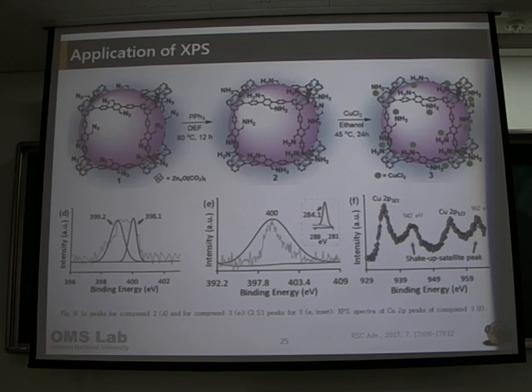Yeah. We give other evidence, for example, TGA. TGA is not very good, but we give this as one kind. TGA, how do you? We try to demonstrate or give some information: what is the difference after modification and before modification? Because this one also contains metal, this one also contains metal, but after the copper, the TGA is a little bit different. You are seeing the degradation of what? Degradation of copper or degradation of the amine?